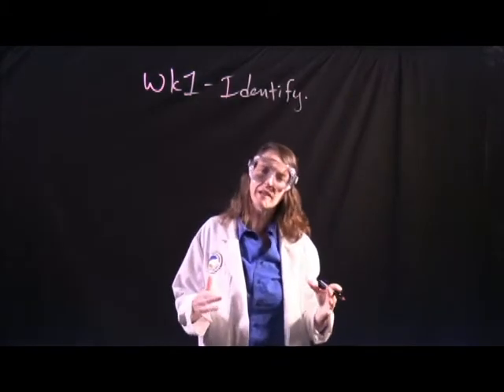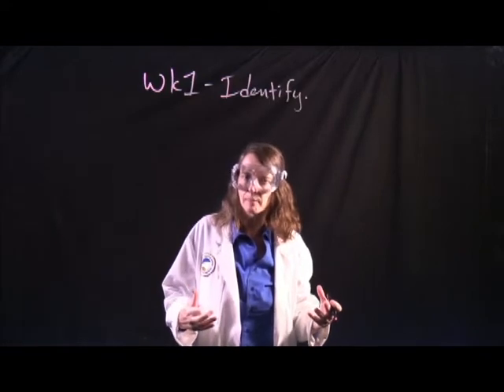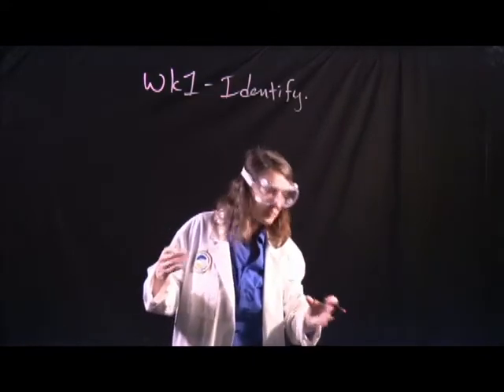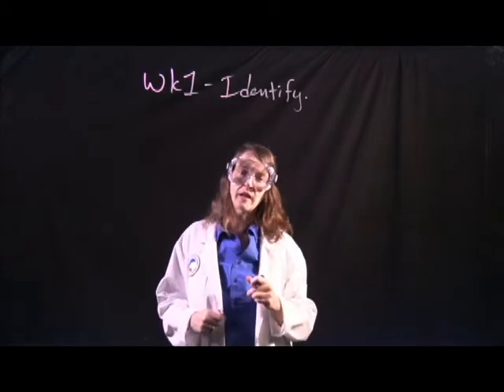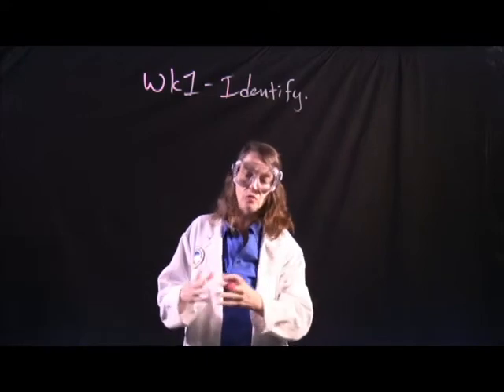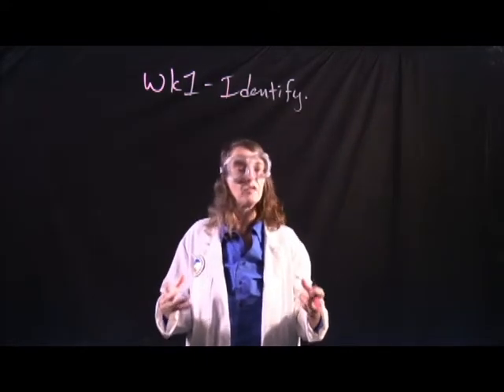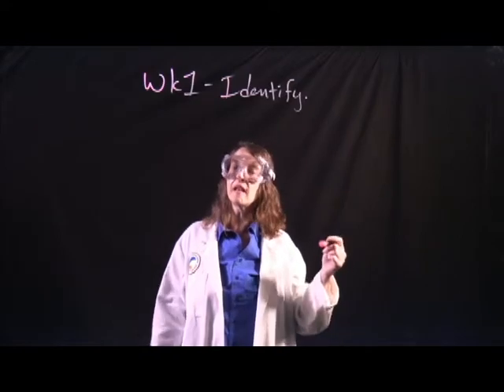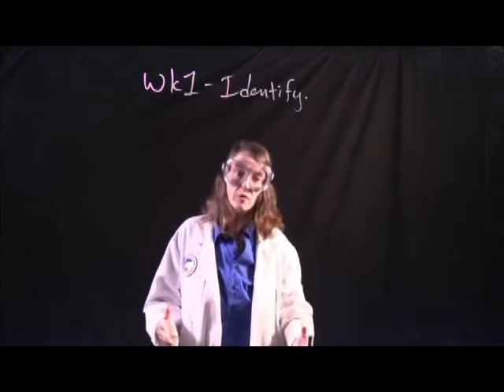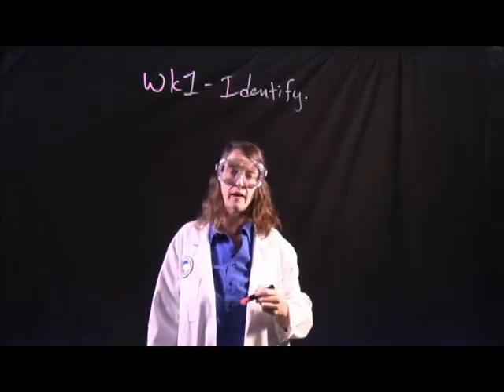Now, the project lab is a little bit different from other labs that you've done to this point. Typically with your labs, you start at the beginning and you work through to the end. Not so here. For the project lab, you need to read through all of the given information and look for the information that you need. For example, find the experiments within this written material that will allow you to identify the compound.